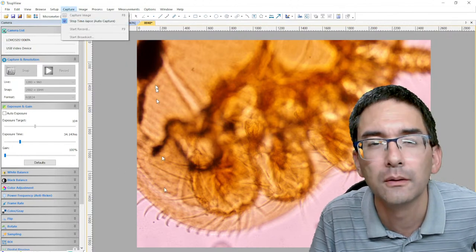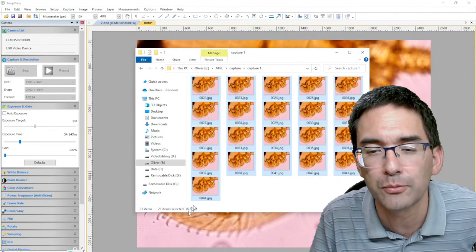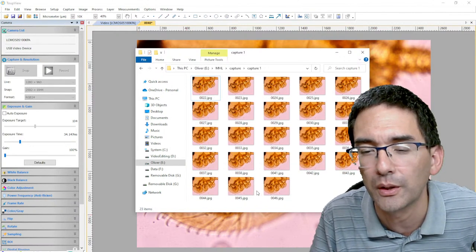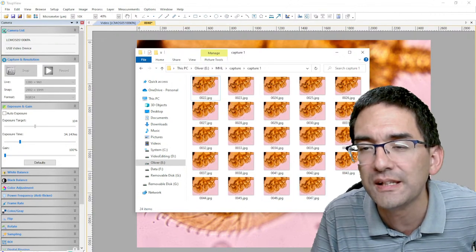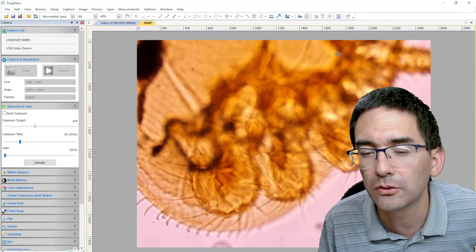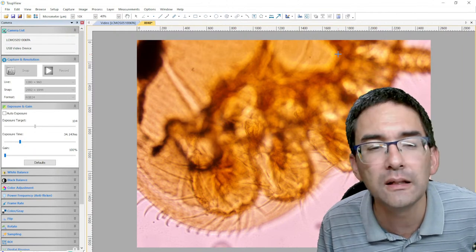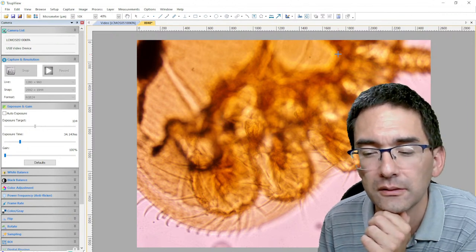Okay. Did it do that? Did it start capturing now? Yes, it continues. Okay, but I forgot to delete the previous ones. So I'm going to start using from 47. Okay. And then I turn it briefly. Now, interestingly, it does not show me how many pictures it has taken.